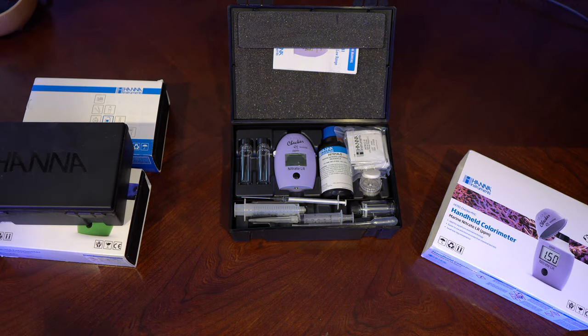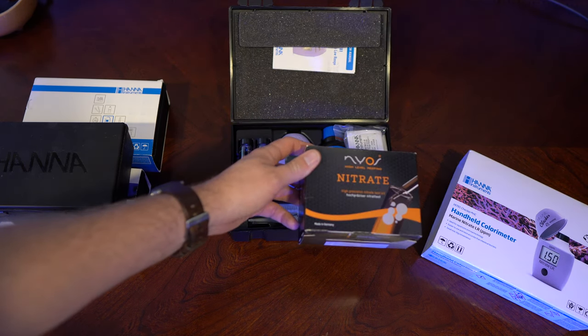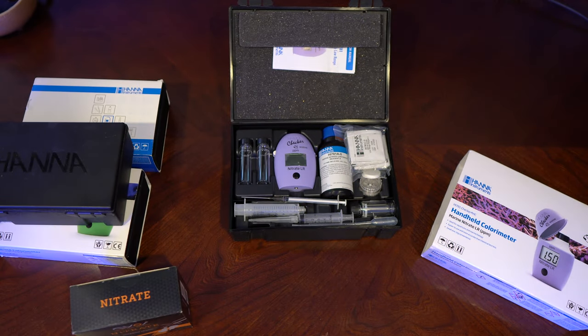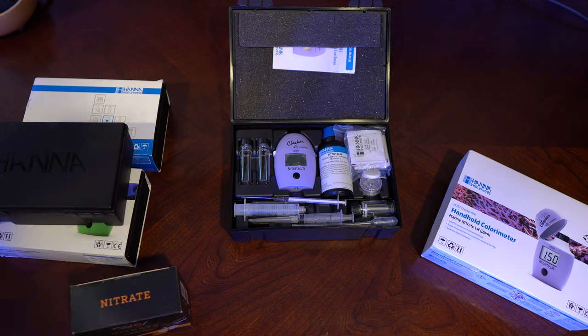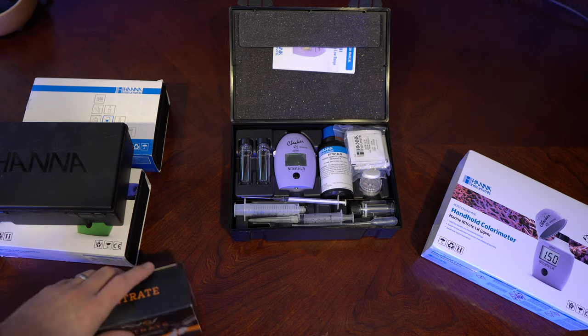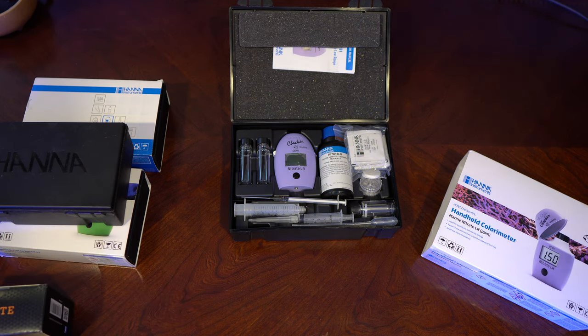I'm going to run you through how to do a nitrate test. I used to test for nitrates with this NIOS test kit — it takes about eight minutes to do. I'm still undecided if the HANA is better in my opinion. I think it will be more accurate, especially for low ranges. However, due to the complexities, depending on what your goals are, it isn't the best test kit in my personal opinion.